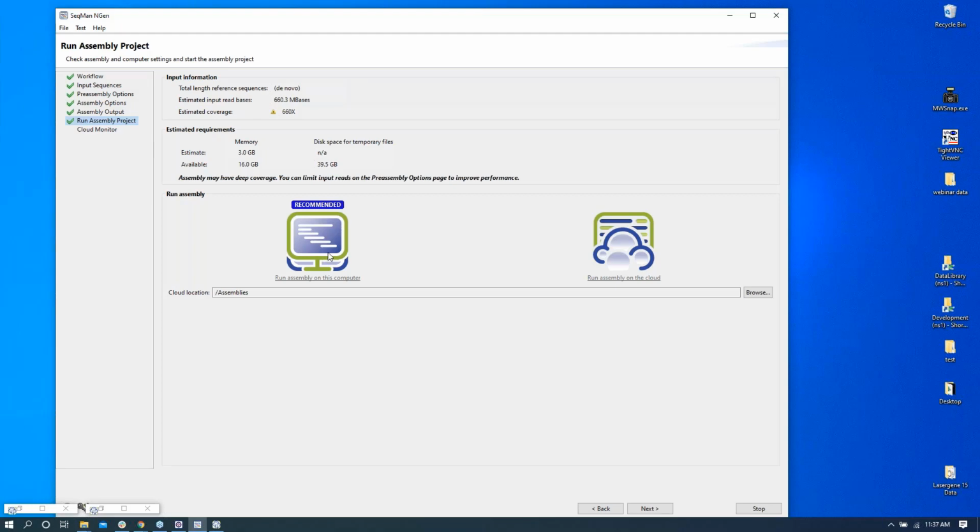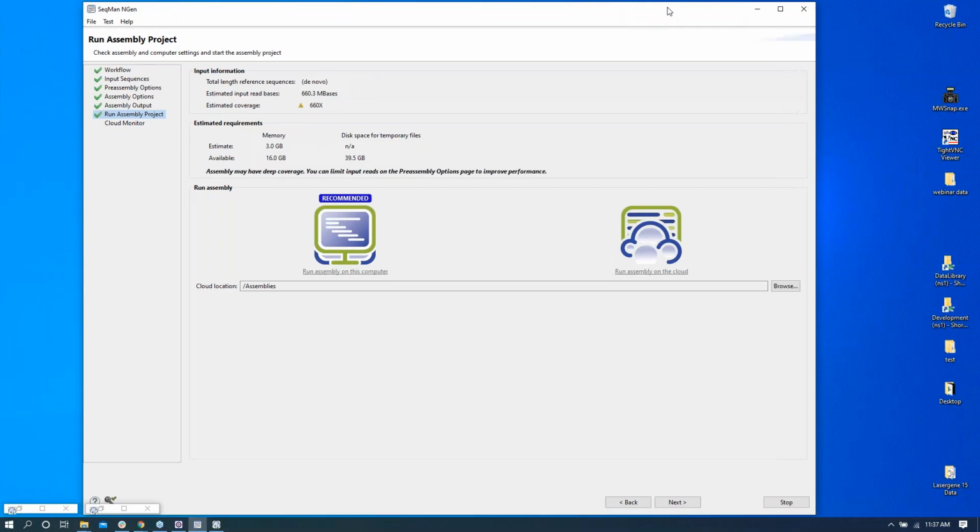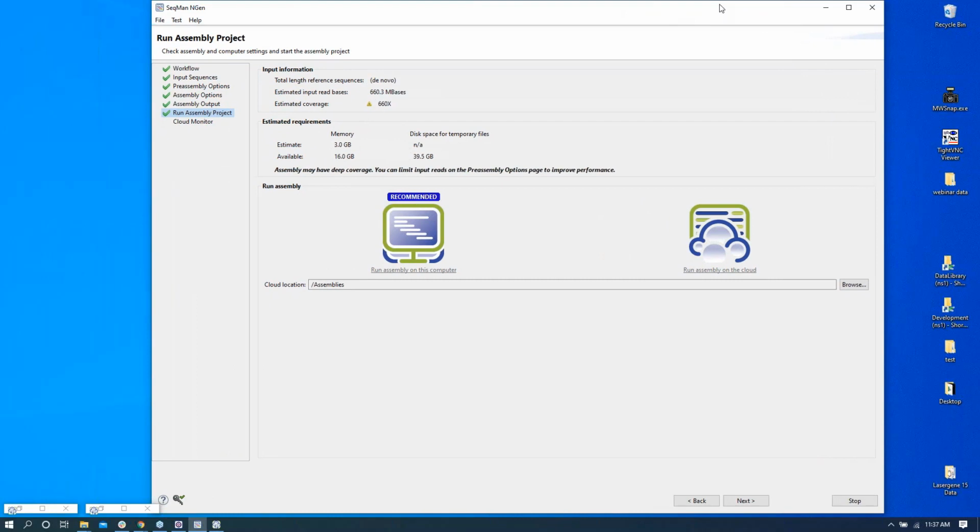So with that, I'd be happy to take any questions from anybody that's interested in cloud assembly. Okay, thank you, Matt. We have a few questions. First of all, can other staff members in my lab share data that is in the cloud data drive?